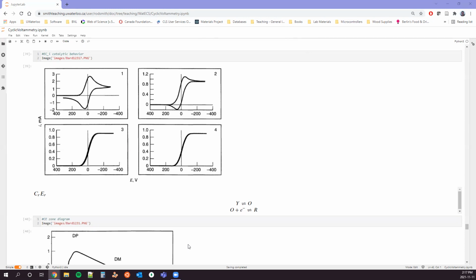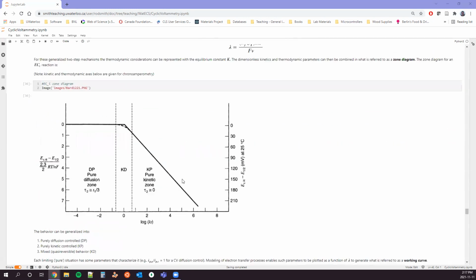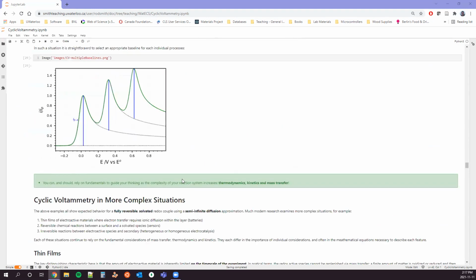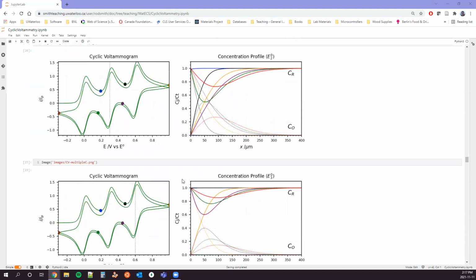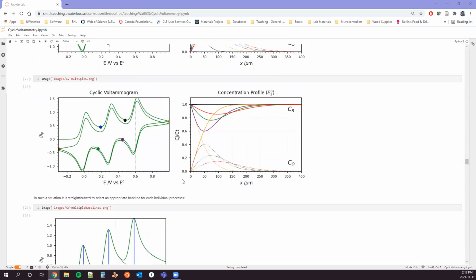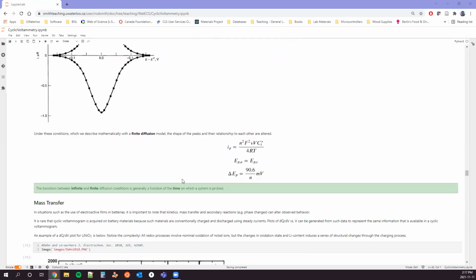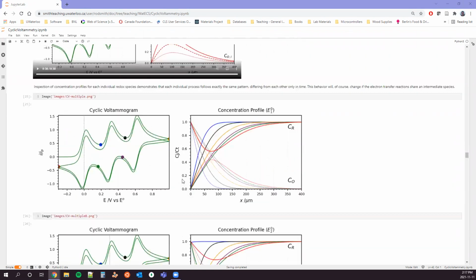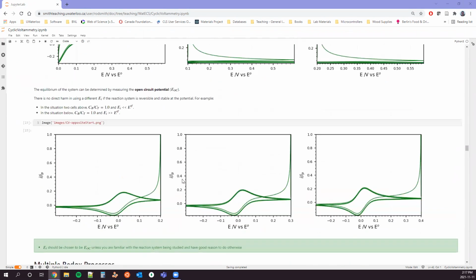I'll ask another one while I wait to see if there are any other questions. We talked a little bit about how there's a difference between the second scan on the CV versus the first one. Would you say that it's typically steady state by the time you've done the second scan, or is that something you have to test for every system to make sure you're getting a repeatable result for the third and fourth scan? You do have to test. Again, it depends. It's a function of your starting point, your switching potential, and your scan rate.